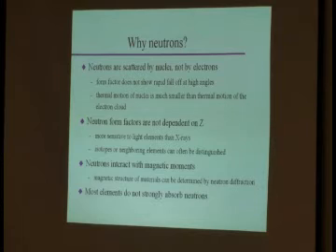Another very big one is your neutron form factors, which is the same as the scattering factor that we talk about with X-rays, does not show a strong dependence on the atomic number like the X-ray scattering factor does. Okay? That means, in comparison to X-rays, you really see the light elements better. You can sometimes distinguish neighboring elements very well, and in specialized cases you can even distinguish isotopes of the same element because the nuclear structure changes. So they look different to neutrons. Okay?